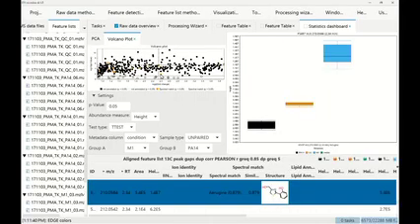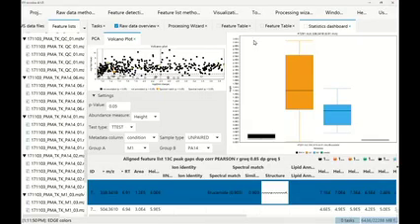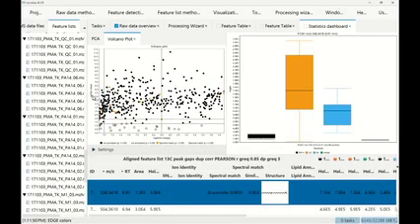So this one, for example, is a singleton, so it has no connection to anything. This one is actually connected, and you see the network, if it's on a different screen, now you would directly get feedback and see, okay, this actually has an MS2 spectrum, and it also has some other spectra that we found that are similar in my data set, and maybe some annotations. So we now try to basically combine all the standard statistics with the networks and everything, make it interactive and dynamic.